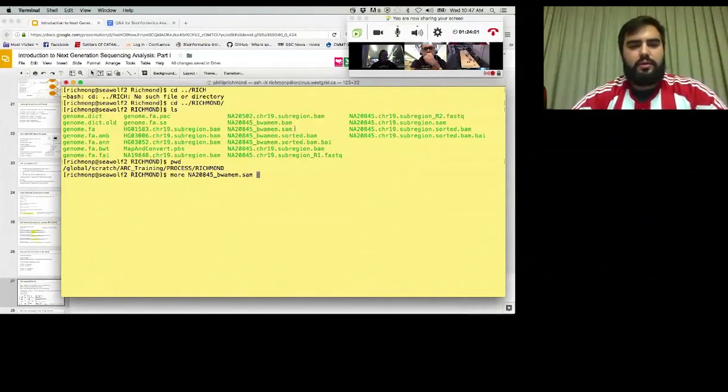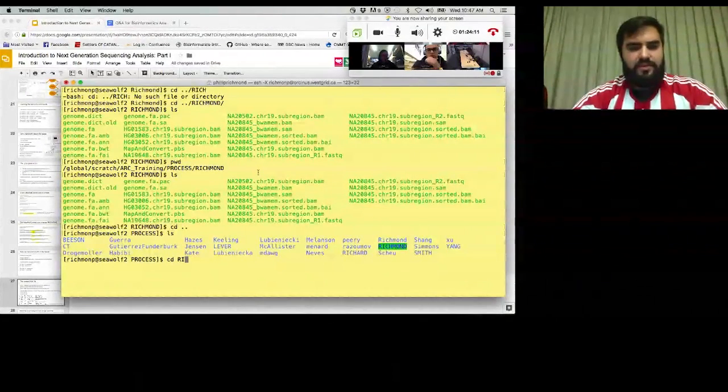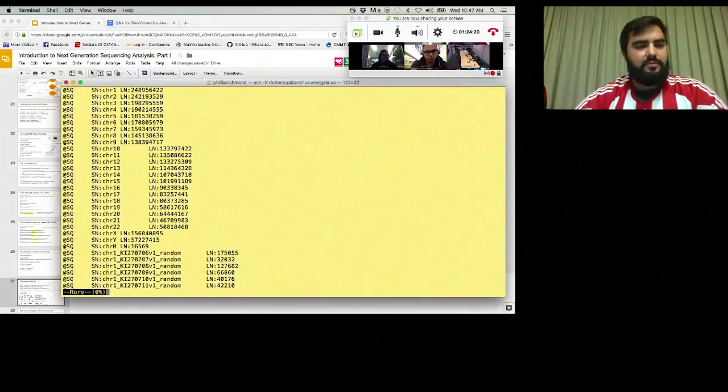So again, you can go into my directory while we wait, which everyone should have permission to do. And if we take a look at this SAM file, then at the top we have these @SQ lines.